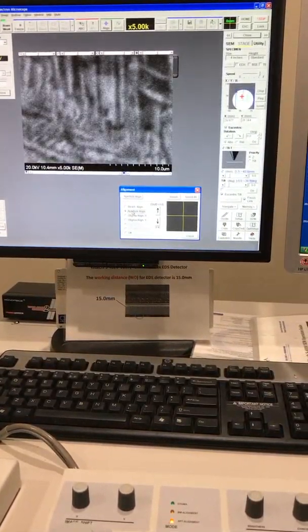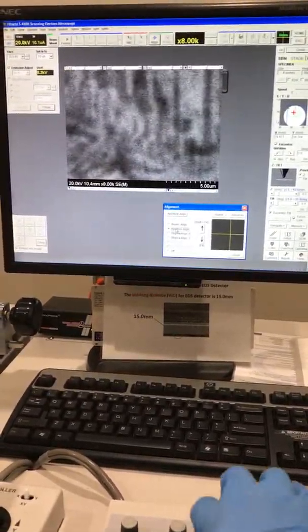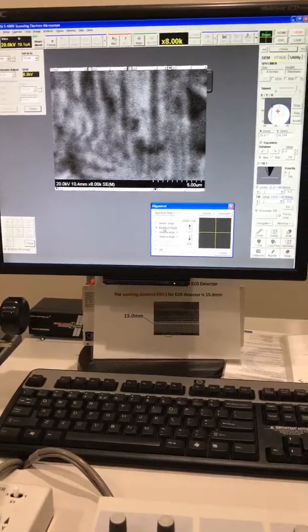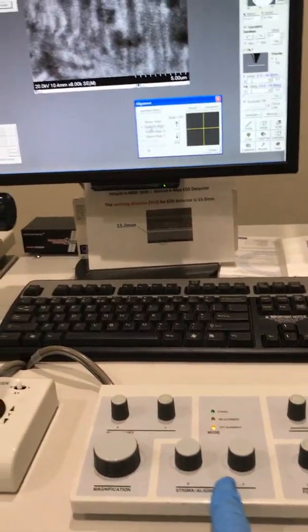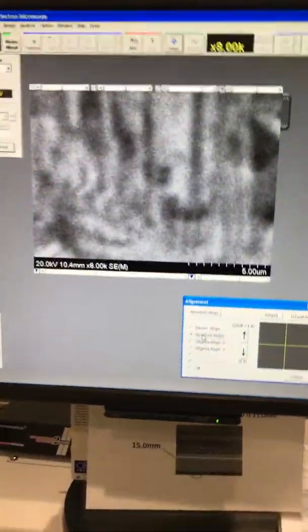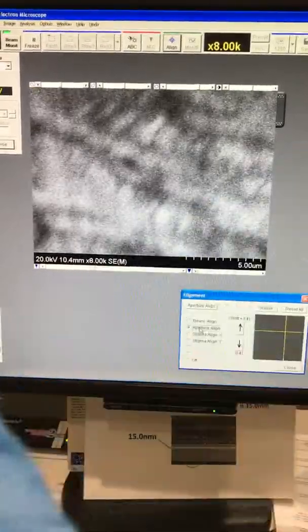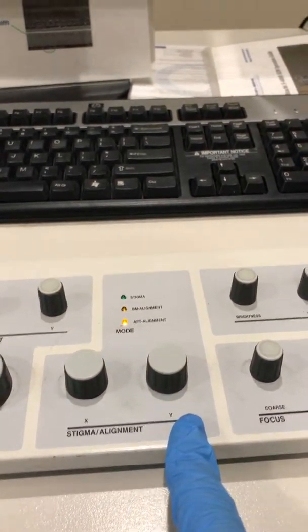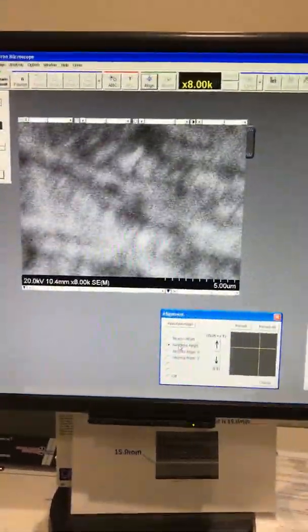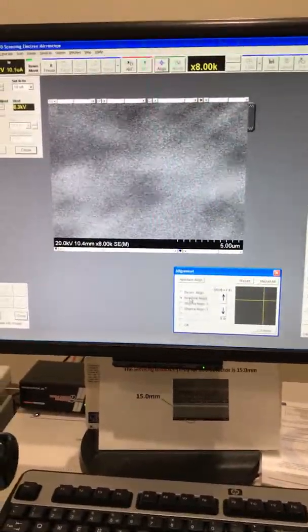Next thing is the aperture line — make sure your aperture line is going in and out. Right now you can see it's not going in and out; I have this kind of movement on my image. So I need to adjust both X and Y. I'll start from X.